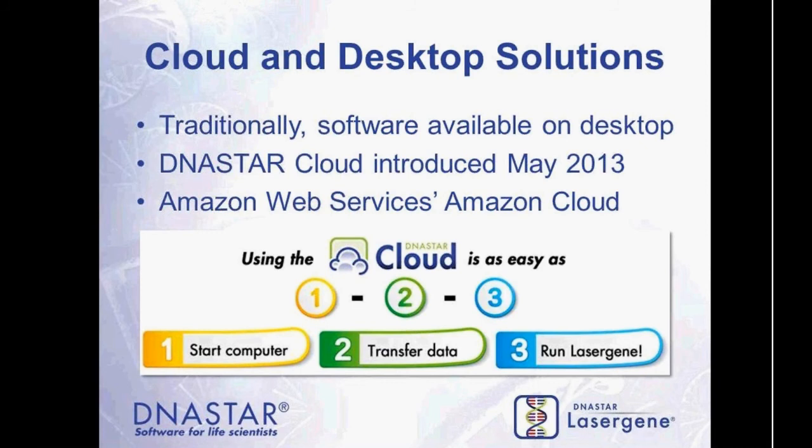Some advantages to using the DNASTAR cloud offering include access to powerful hardware without having to purchase this hardware yourself, the ability to run multiple jobs simultaneously, the ability to monitor your project from multiple different devices, easy remote collaboration with your peers, as well as some flexible licensing options. So I just want you to keep in mind that the cloud solution is an option for you to run some of these workflows that we'll be discussing today.